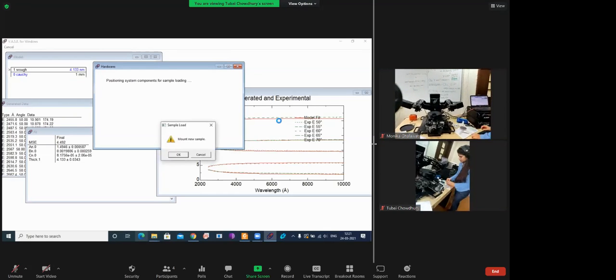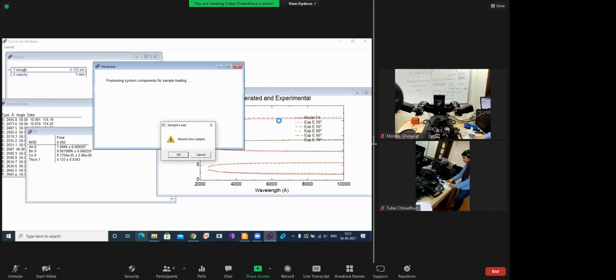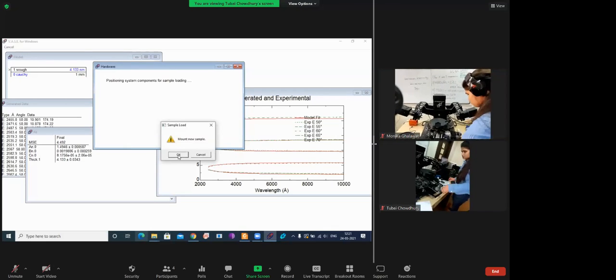Just give me one sec. After that, I will explain. Mm, hmm.